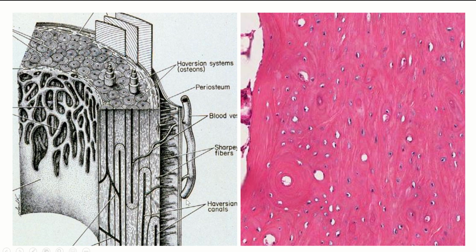And then here is a real picture of bone. It doesn't have that special stain, so it makes it harder to understand things, but here you can see, right, this is that Haversian system with those concentric lamellae. They're all radiating out around the center, so that's going to be a Haversian canal. And here you can see those little lacunae, those spaces, and within those spaces are going to be those osteocytes.